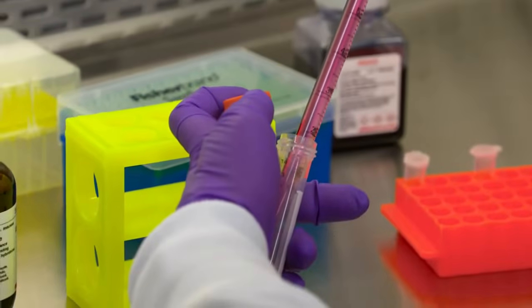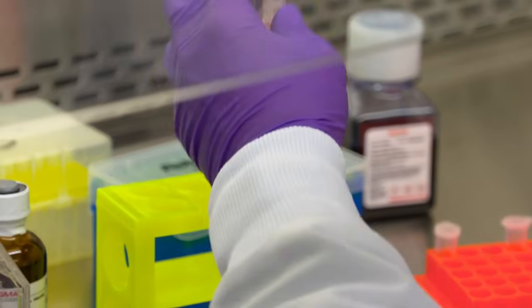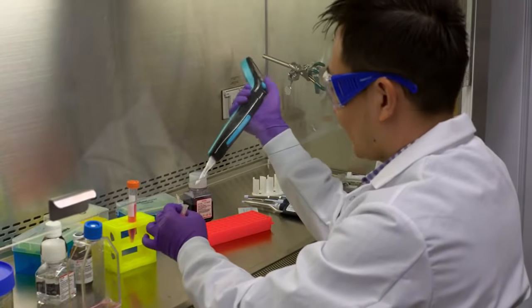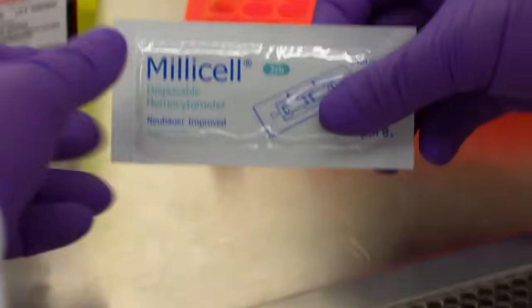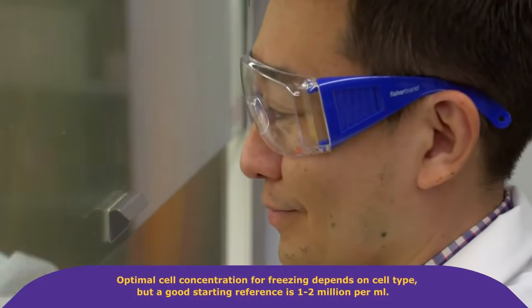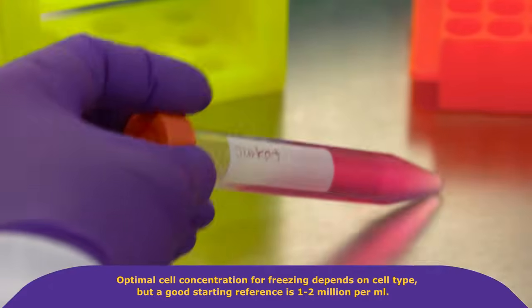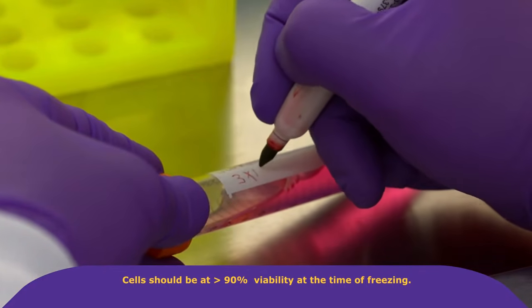Deactivate the trypsin and resuspend the cells in culture media, then transfer to a 15 ml conical tube. Take a small aliquot for count or count plus viability assessment using the Scepter cell counter or Millicell disposable hemocytometer, respectively. Optimal cell concentration for freezing depends on cell type, but a good starting reference is about 1 to 2 million per milliliter. Cells should be at greater than 90% viability at the time of freezing.